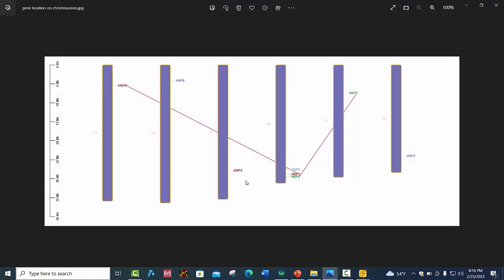You can now use this illustration in your manuscript. In this manner, you can easily locate the position of genes on your chromosomes. That's all for today's lecture.